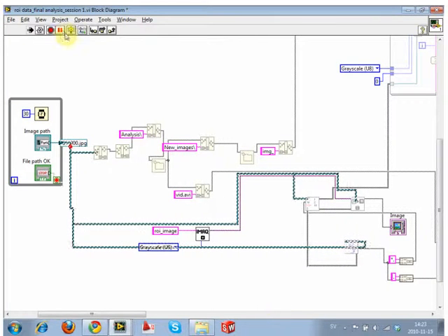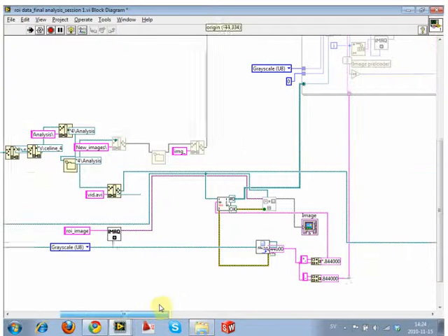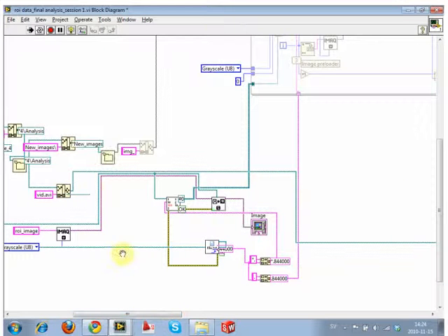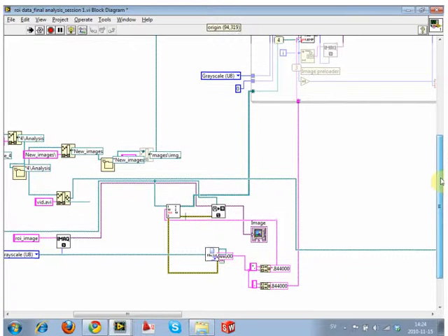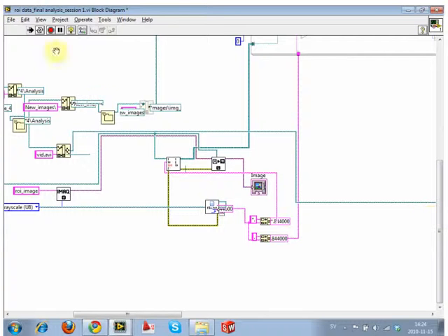So it makes this, it writes that. We're just scanning all of these files right now. It writes those ones. Okay, it's made that file, it's made that file. Okay, I see where the issue is. Now I'm gonna hit pause to see if you guys can see what the issue is.